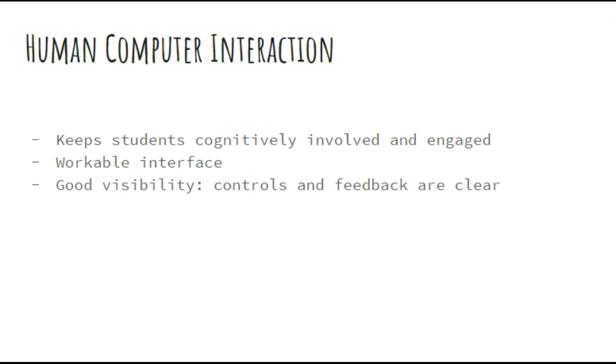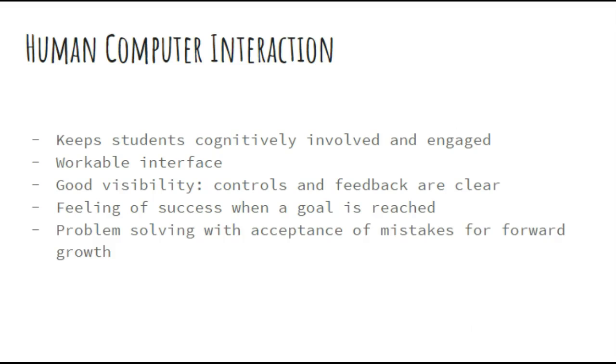Another human-computer interaction component is the learner's opportunity to feel success at reaching certain goals, such as when they are guided through the use of the microscope and are finally able to view the specimen. Overall, this technology is a problem-solving interactive tool used to harvest an environment where students are exploring, having minor setbacks, and moving forward to compile an understanding of the interface to solve an overall problem to view those microscopic organisms.